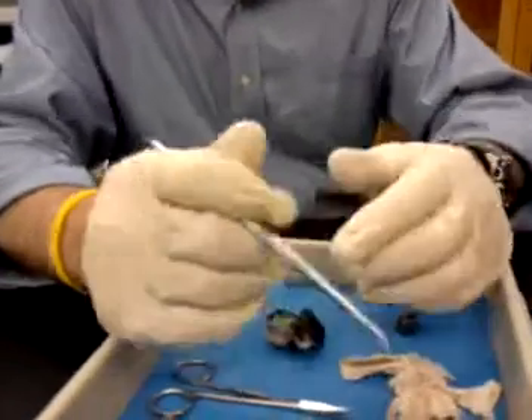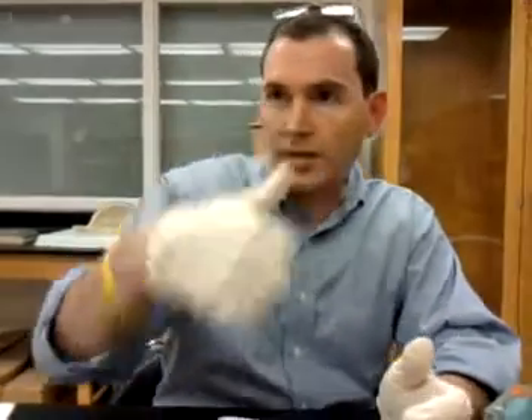Now, what you're going to do with the rest of your time in your group: grab yourself an eyeball and do the dissection. You have a sheet of exercises that he wants you to do with light and test tubes. Make sure you try some of those — they're well explained in the book. He gives some questions on each of the activities that he wants you to answer. I'll walk around and try to help you with some of those activities. Get to work.